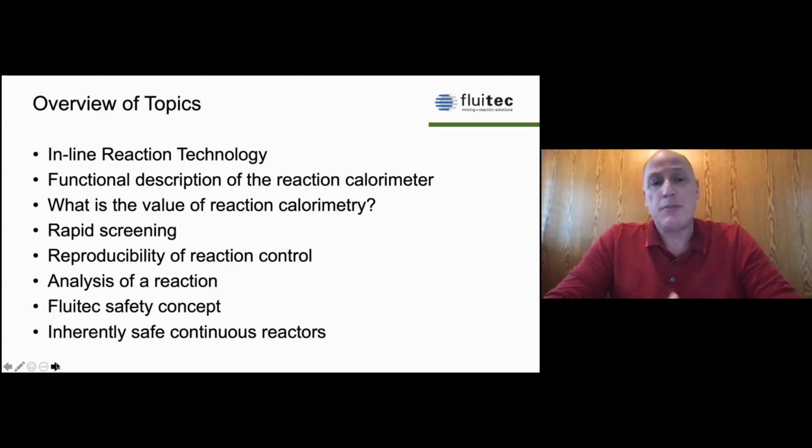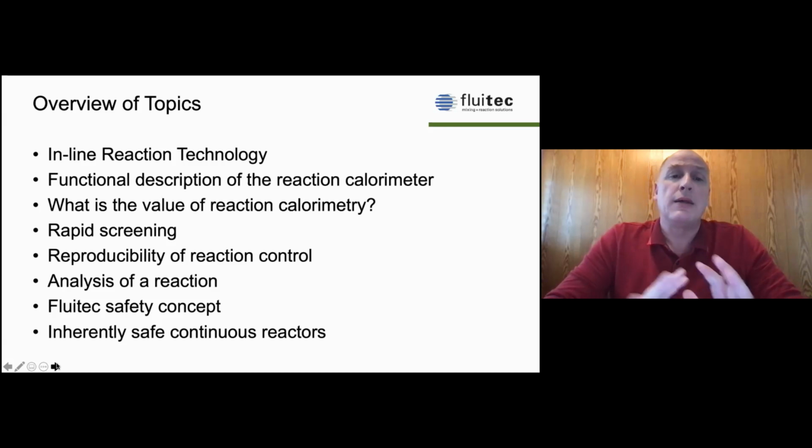I'll describe a little bit the functional work of the reaction calorimeter, what the value of a reaction calorimeter is, shortly show you the rapid screening, the reproducibility of reaction control, and some analysis and some examples.